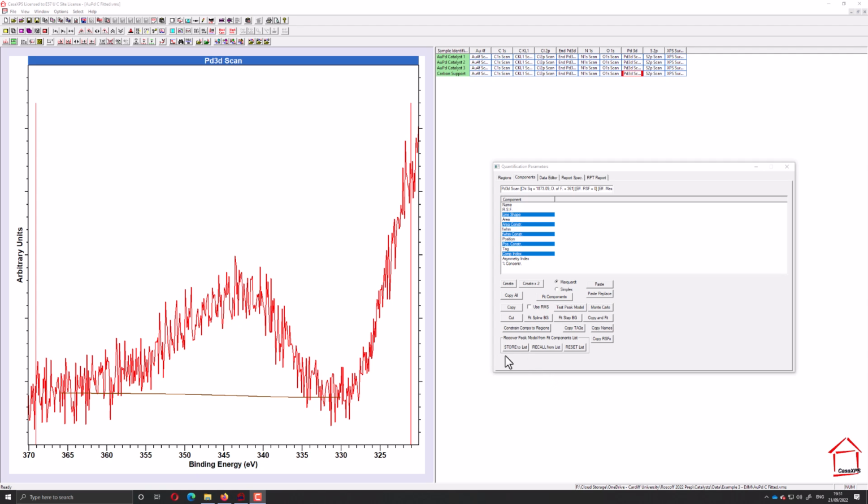So what we're going to do now is model that background very simply by using some highly constrained peaks. Again, there are other ways to do this, but I find this to be relatively straightforward and simple, providing we're cautious about how we apply differences or peak positions and distances and full width half maximums and so forth.